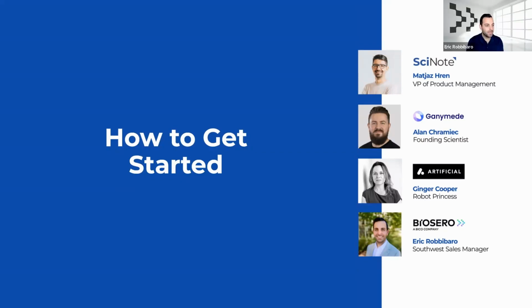I think that as far as getting started, the golden rule is, do not get so excited that you jump into the deep end. Take it bit by bit, make sure that you have the absolutely essential part of your process that you want to have automated, and automate that. So whichever software you choose, and then the essential instruments, and just link that together with a robotic arm. That's it. Don't get drawn in by all the shiny things.